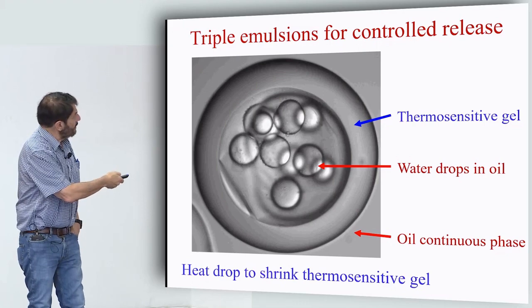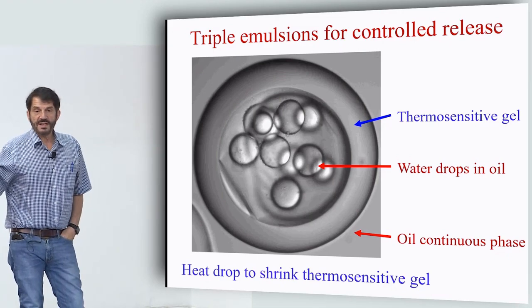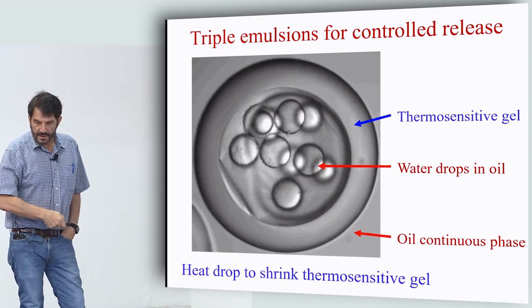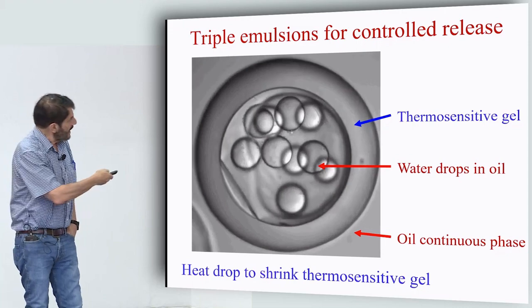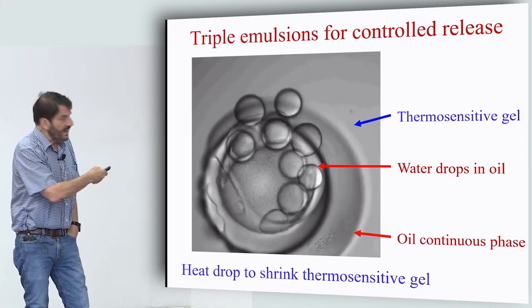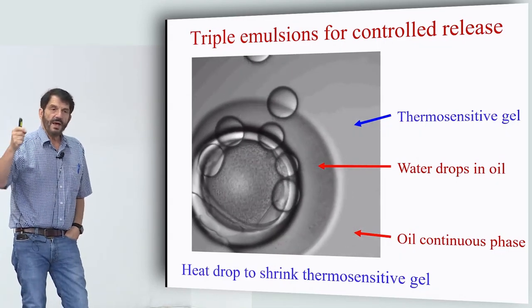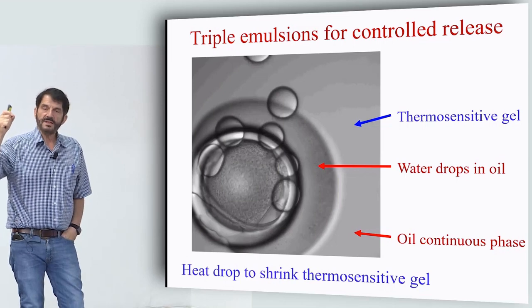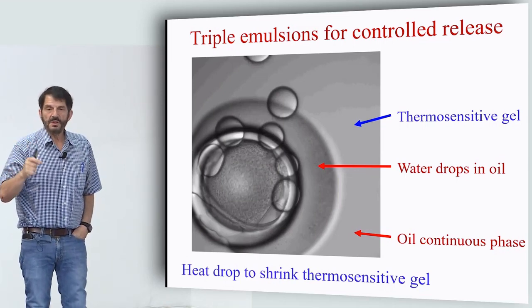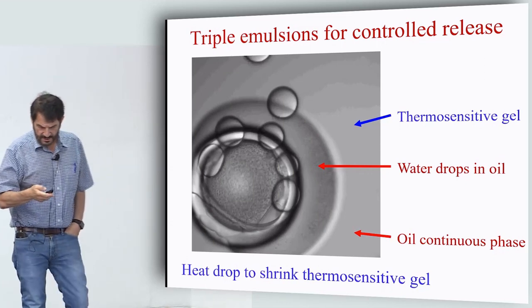So to protect it, he built a hydrogel shell that in this case was thermosensitive. So if you heat it up, the shell starts to shrink. It tries to compress what's on the inside. It can't compress it, so instead it tears itself apart and it releases what's inside. So now you have a way of not only really precisely controlling the encapsulation, but you also can control the release. It's just now limited by your imagination of how you make these things.